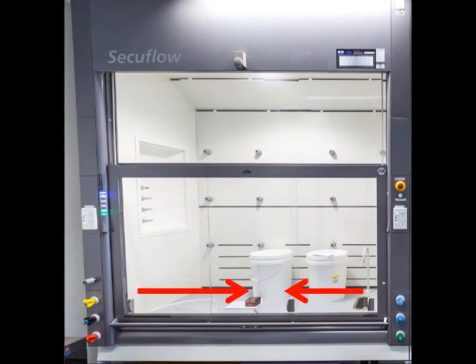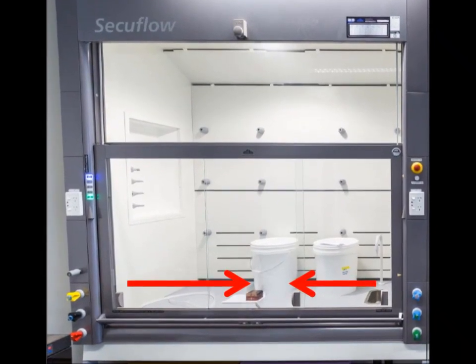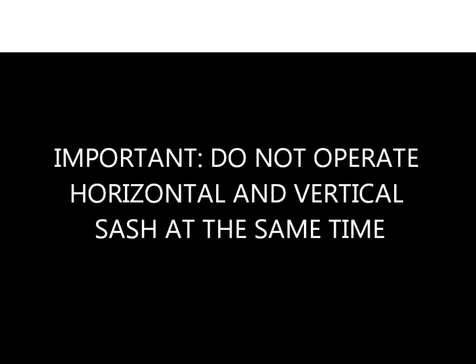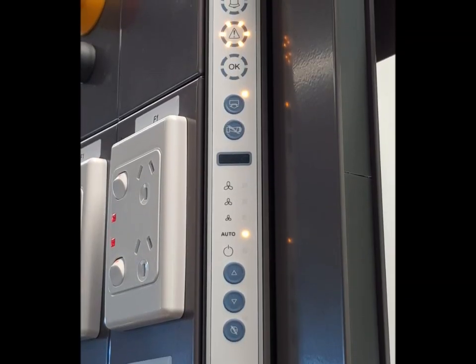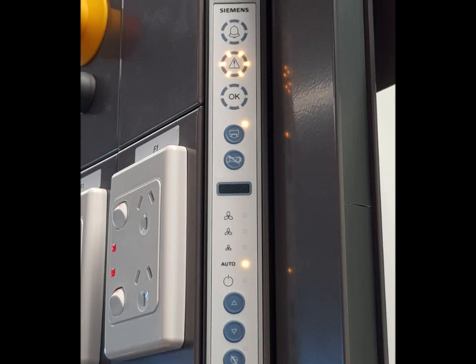Horizontal Sash Operation. To operate the sliding glass doors of the fume cupboard, which is called the horizontal sash opening, simply slide the glass doors left or right to access the work area. Important: Do not attempt to operate the horizontal sash and the vertical sash at the same time. If the vertical sash is open plus any of the sliding glass doors are also open, you will see a yellow warning LED at the operation panel, indicating that this position is not a safe working opening and should be closed.